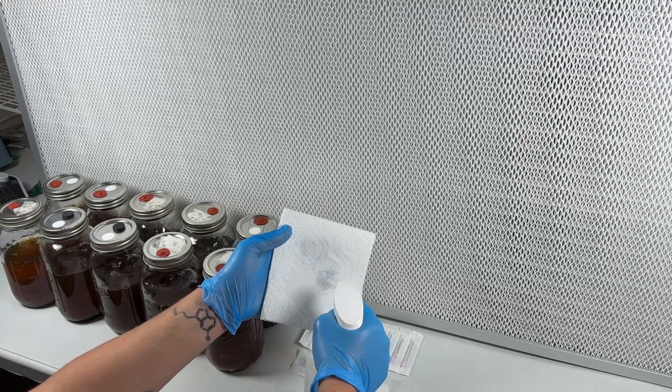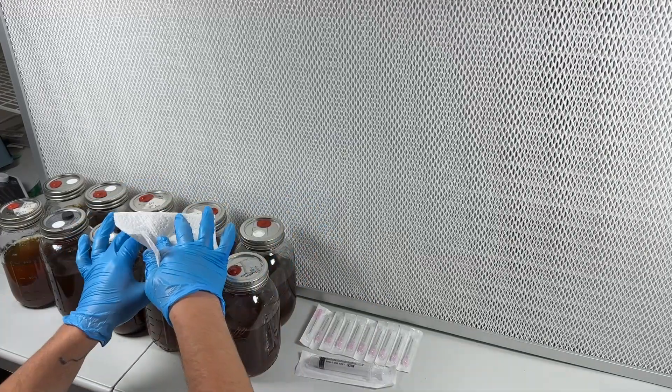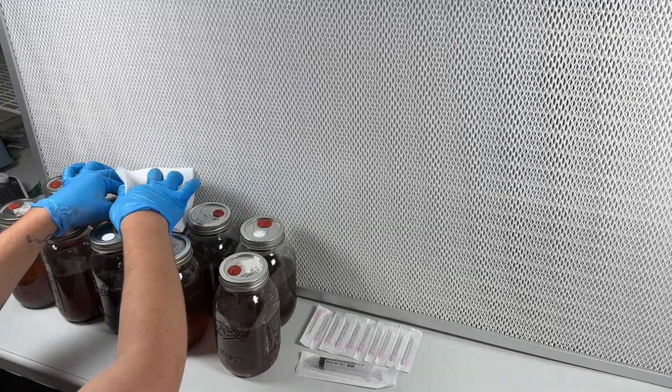Welcome back to Spore and Sprout. In this video I'm going to show you how I batch test mushroom liquid culture jars for contamination.